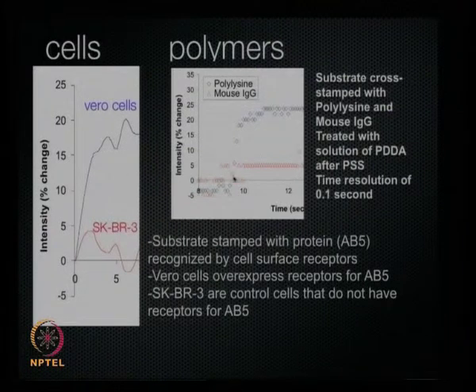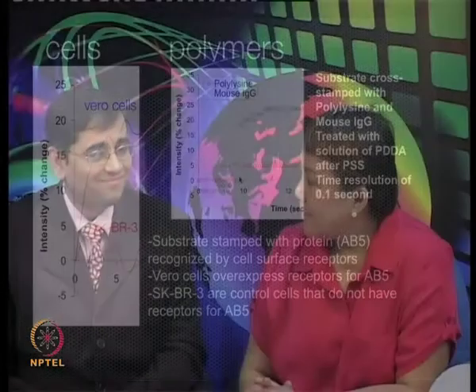Okay. We can skip the other ones, other than proteins, but just to show you that you can measure cells, you can look at polymers, because the measurement of interaction is general. You can measure the interaction between two types of molecules. Okay, so now you've got a prototype, and probably you can discuss how you took the prototype to commercial scale, because ultimately you need a lot of applications to develop.